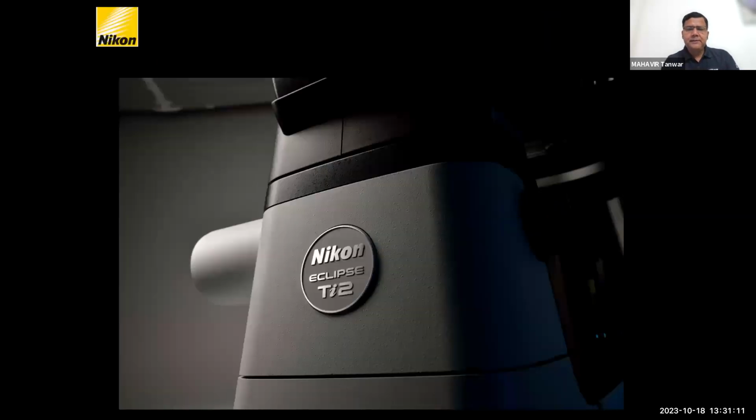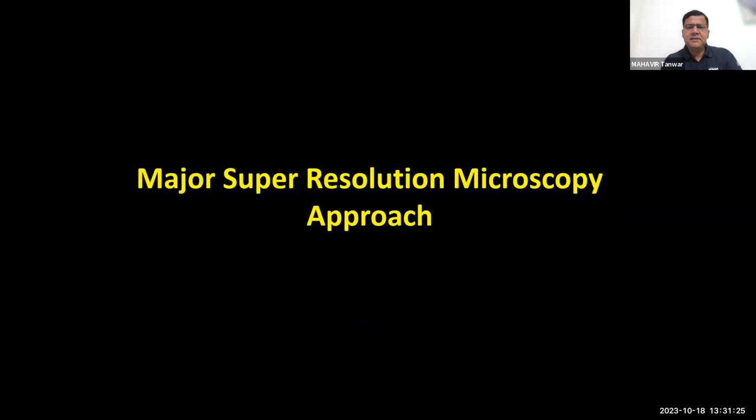So again, the microscope is important for super resolution also. The microscope will remain the same, an inverted microscope in this case. First, let's see what are the major approaches towards super resolution in the market.